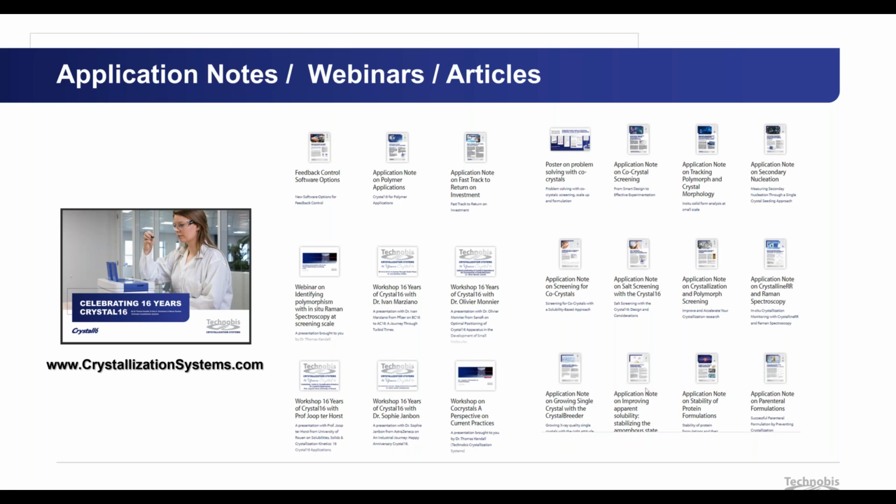If it's a chemical impurity, I would definitely play with the different solvents. Try to map the solubility of the compound and the impurities if it's possible, and even in solvent mixtures, to see how you can better exclude those chemical impurities.